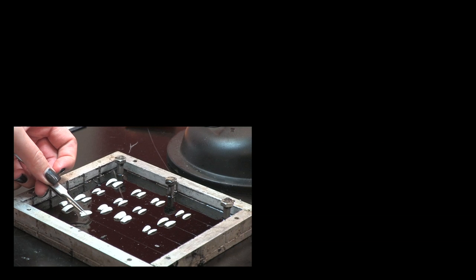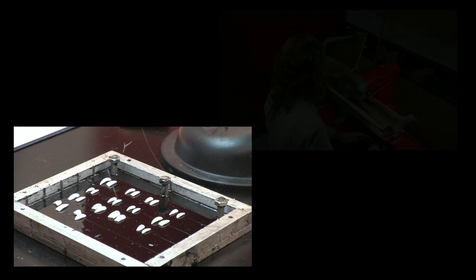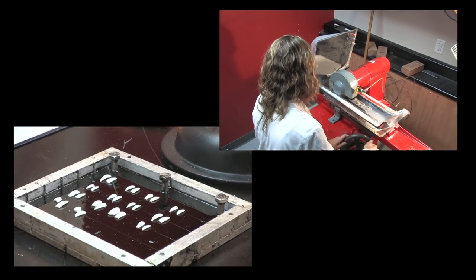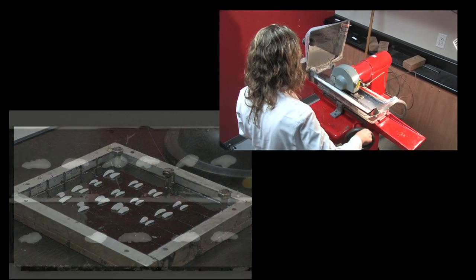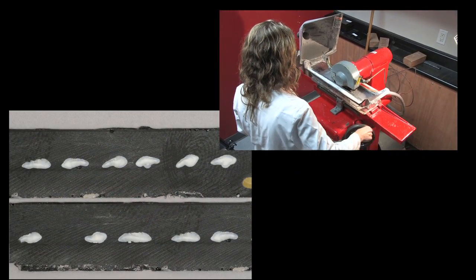This video demonstrates production methods for embedding and sectioning 50 to 100 otoliths at once. The entire process requires three days and will produce one millimeter sections of otoliths that can be used for age determination.